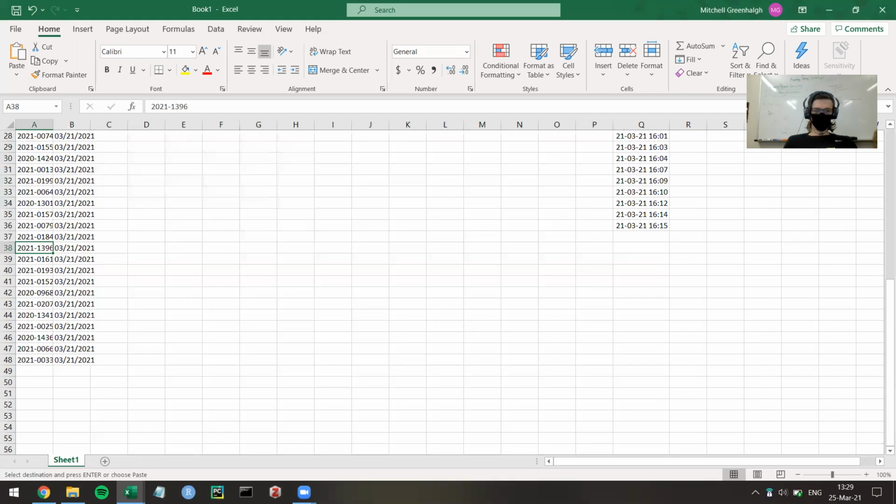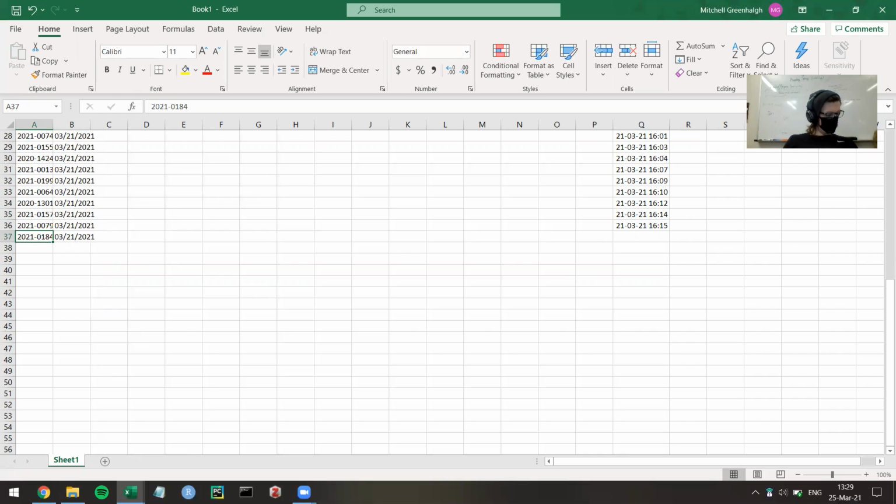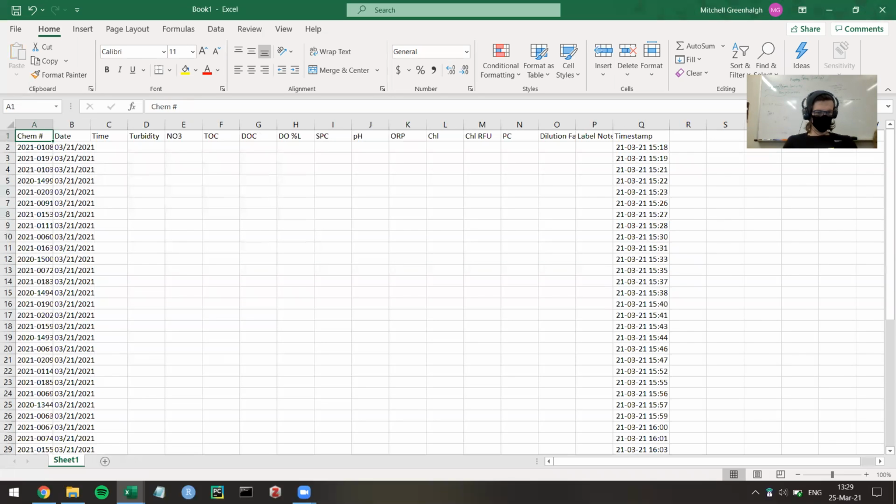Oh, that's why. When I changed it over from the 20th to the 21st, they were stuck at the end. All right. So yeah, this shouldn't happen. So sorry about all of this excess stuff that wasn't actually a real problem.